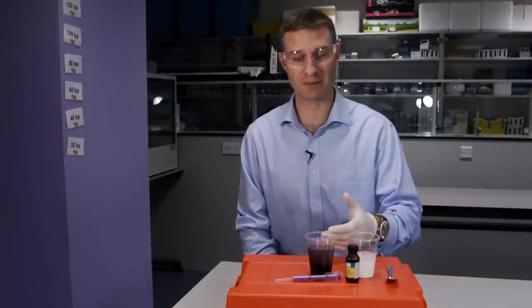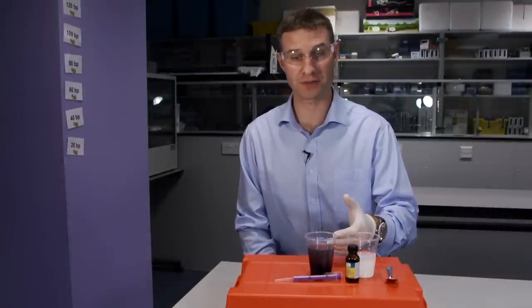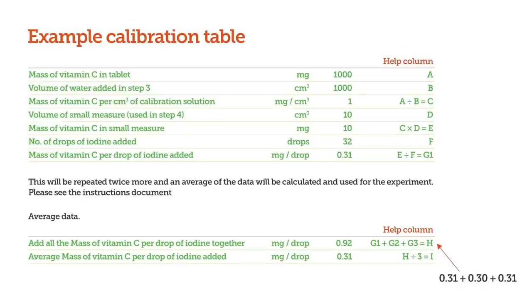So we've just completed the calibration step. This took 32 drops to get the colour change we require. You'll be repeating that twice more to get an average, and then we'll show you the calculations. So this is the calculation graphic for calibrating your solution. You will be able to calculate the mass of vitamin C per drop of iodine. You can also get this calculation from the instructions document on the website.